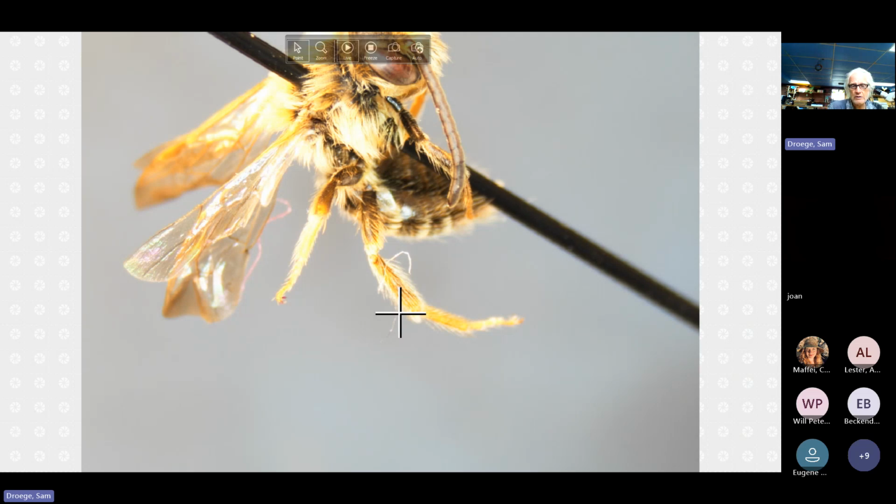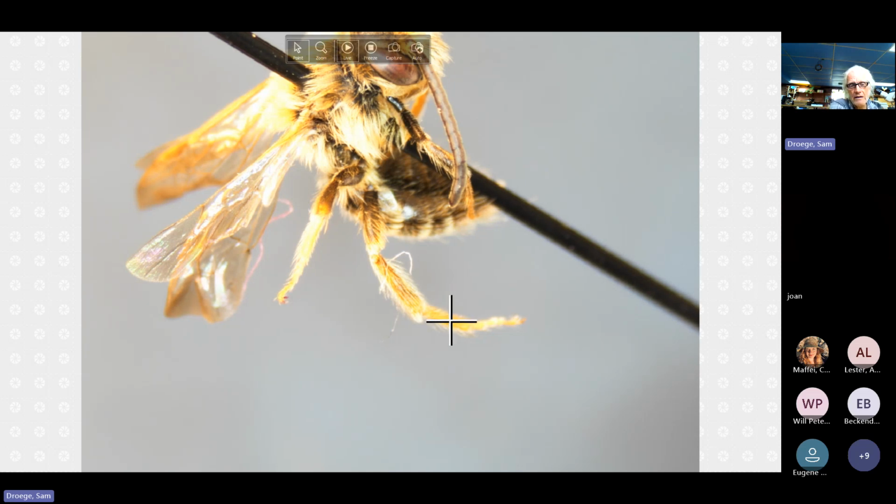And here you can see in particular, this is smudgily yellow at the apical end and the basal end, and a little bit of brown in the middle, but this is clearly all orangey yellow. I should say orange instead of yellow. Here's coming into my eye myself. And so that gives you a strong ID for that one. So that's one that they usually co-occur and they're usually quite common.